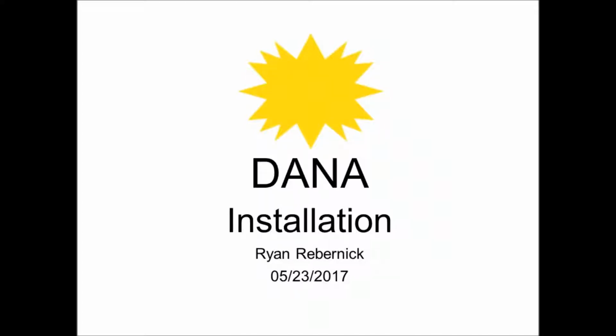Hi everyone, my name is Ryan and I'm going to be talking to you briefly about how to install Dana, DNA Area NETosis Analysis, on your Windows computer.